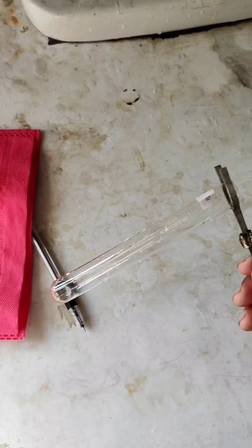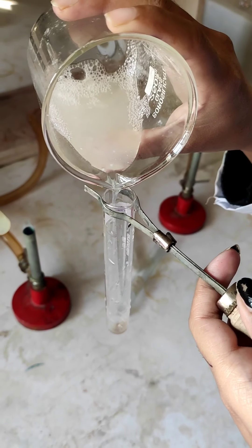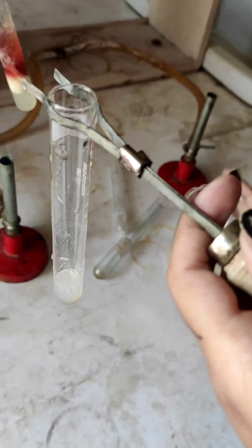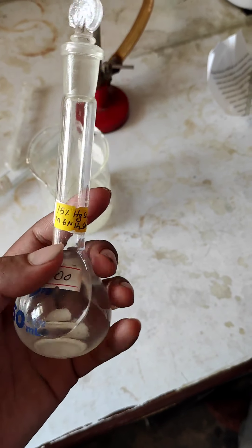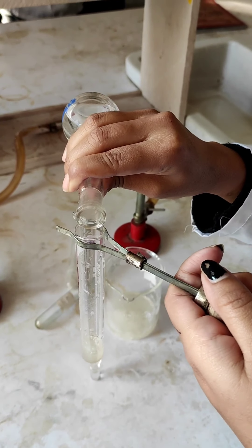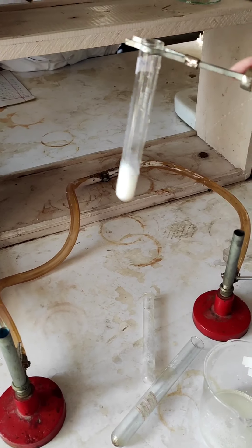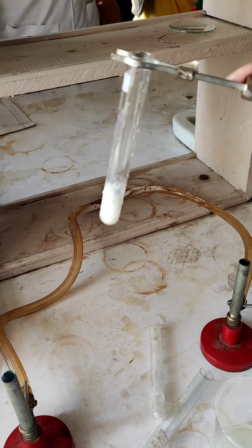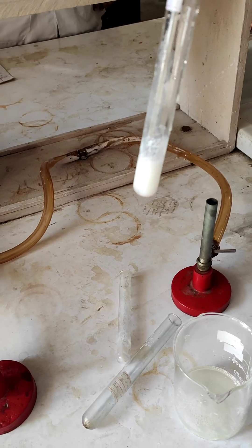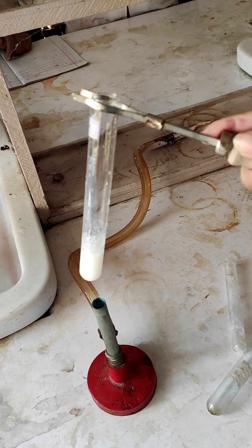Now, place the test tube in the test tube holder. Add 3 ml of sample into the test tube. Then add 1 ml of Millon's reagent. Heat the test tube over the burner.